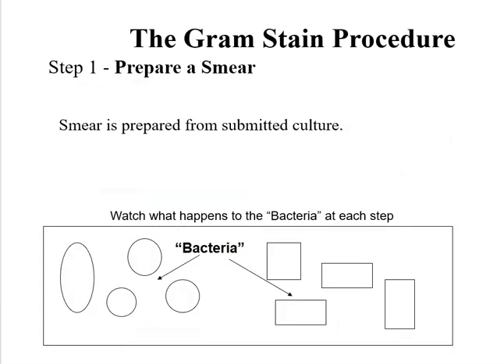So let's look at the Gram stain. So first of all, we make the smear, and you got a video on how to make smears, but basically we take that and we either mix it with water, or if it's liquid, we can just put it straight on the slide, all right? And we lay it down, and you don't see anything except maybe a wet circle or a little bit of the bacteria smeared on that slide.